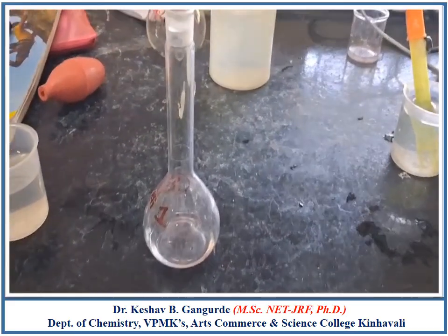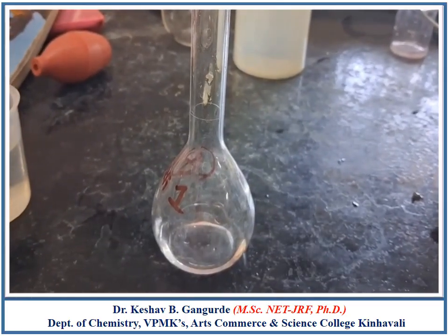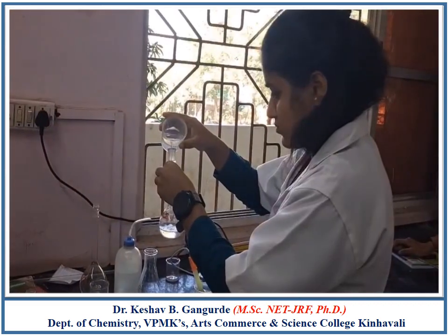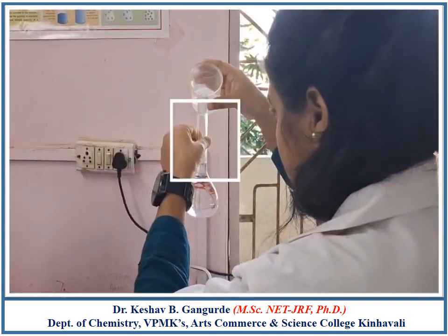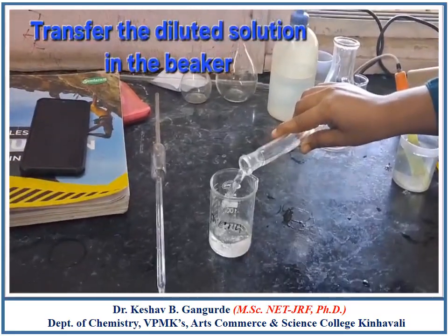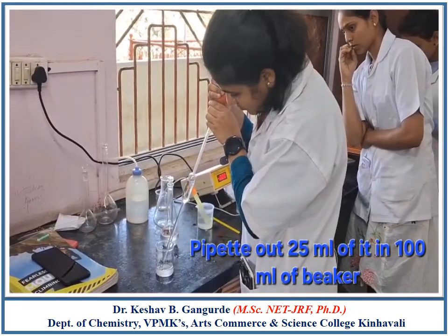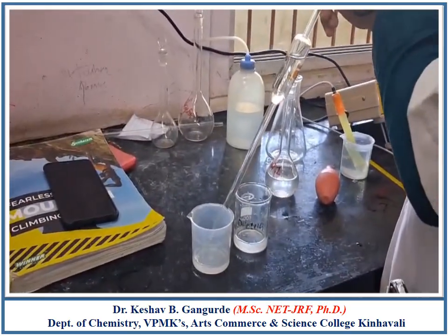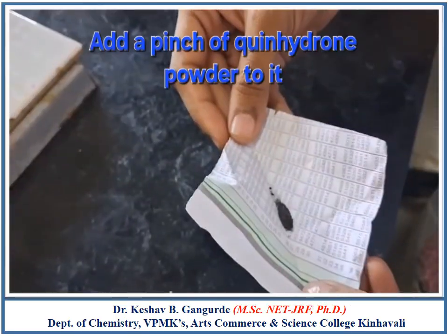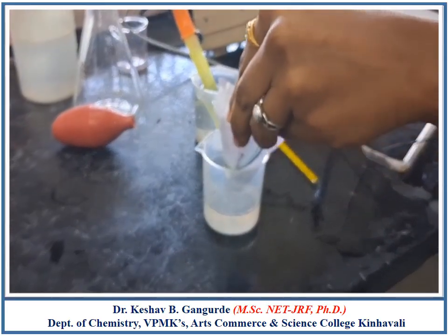On your working table, you are provided with vinegar sample solution in a 100 cm cube standard measuring flask. Dilute it with distilled water up to the mark. Pipette out 25 cm cube of this diluted solution and add a pinch of quinhydrone powder into the solution.